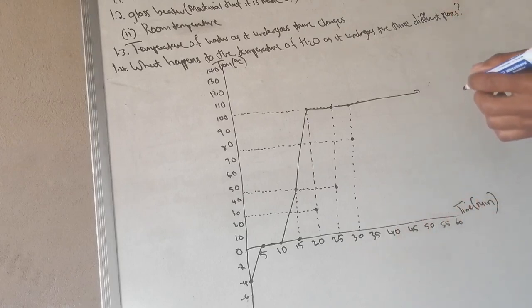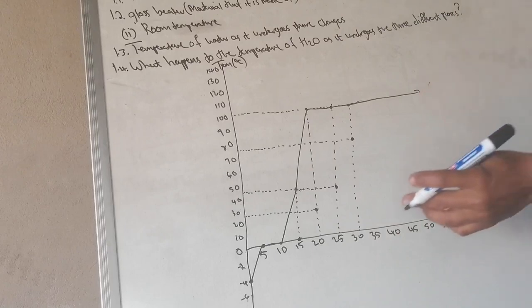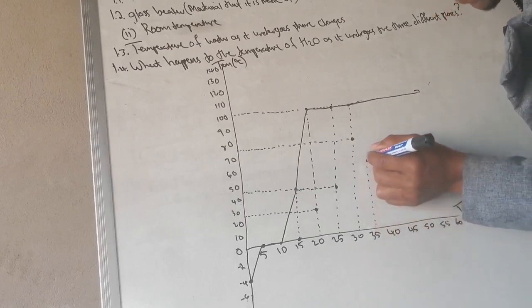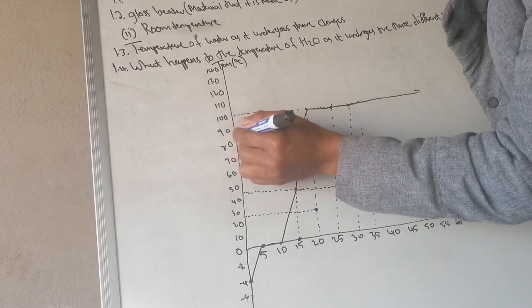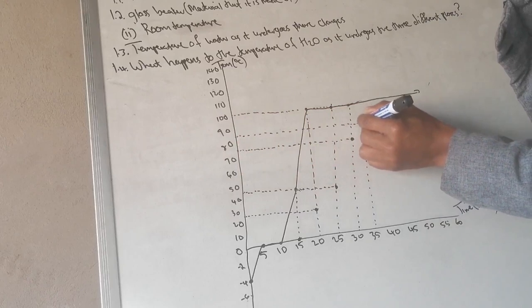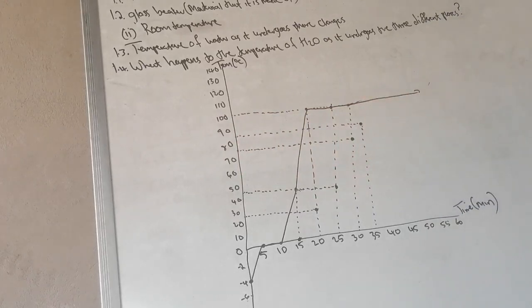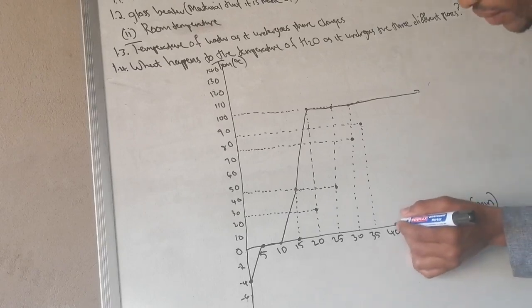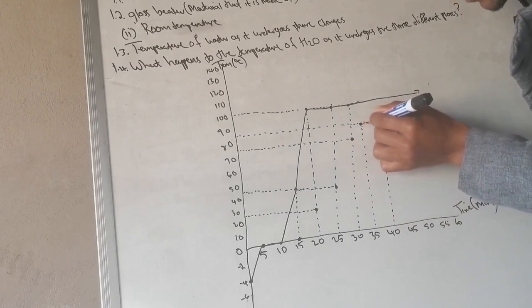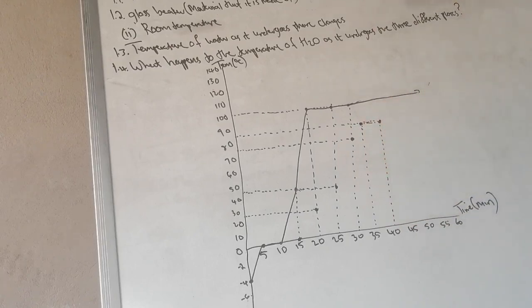Where is this? 35, 85. Sorry, man. Yes, 35, 85. Here we are. There is 85. And then at 40, it remained at 85. Maybe it will even remain constant at 45, 50, 55. It will just remain constant. Maybe. Let's try to draw this cooling curve.